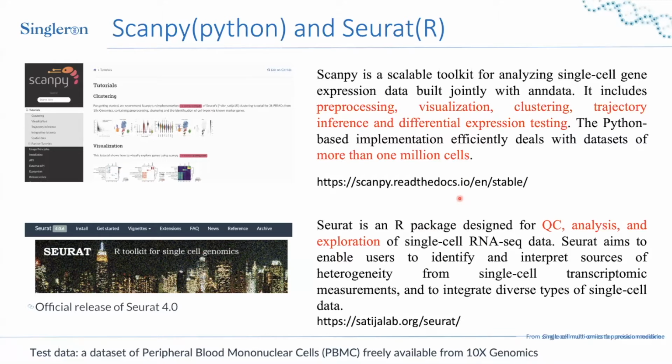If you are interested in practicing with the data, both of the websites I listed here have very detailed tutorials showing how to do the analysis, and maybe you can try to play with it. Today, most of our examples are from Seurat, using this test data.